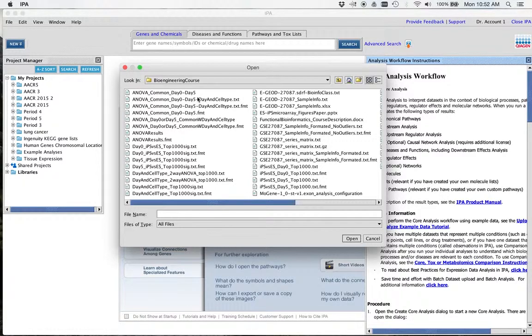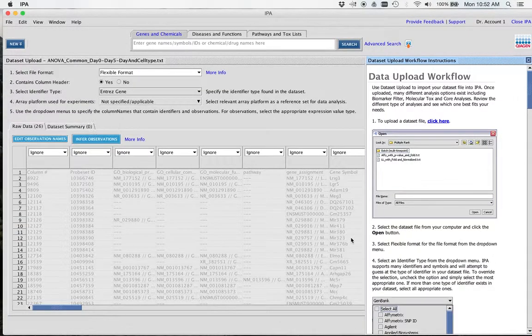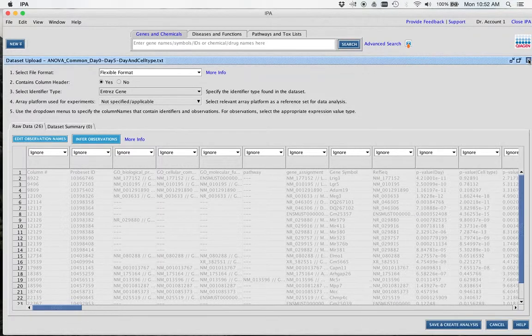That'll be easy. What I also want to say is it has to have a text at the end. This other file is basically information for the Partek program. We don't want that. We just want the text file. So select the text file and say Open. Okay, I'm going to close this window.